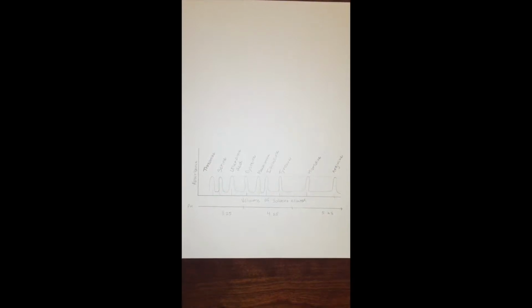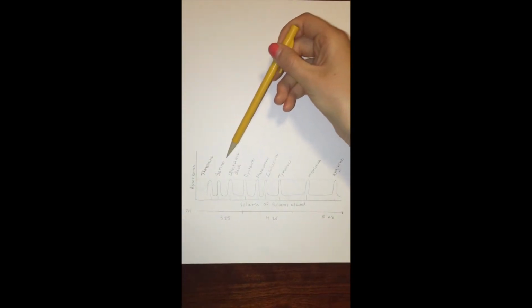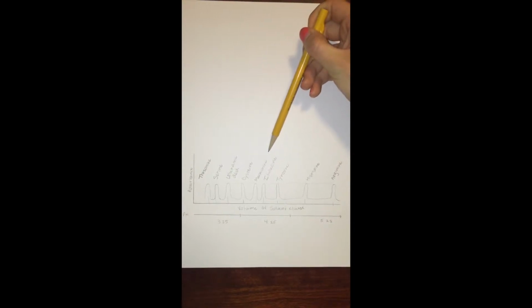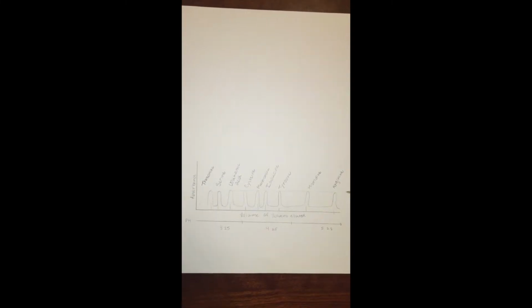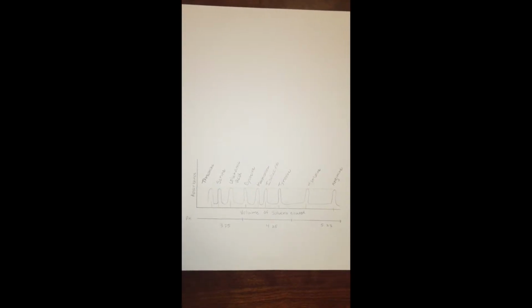After doing amino acid analysis on our unknown protein, we acquired a chromatogram with the following data. Comparing our results to a standard chromatogram, we can see that we have the amino acids threonine, serine, glutamic acid, cysteine, methionine, isoleucine, tyrosine, histidine, and arginine. Since each amino acid shows equal peak heights, we can see that each amino acid is present in equal quantities.